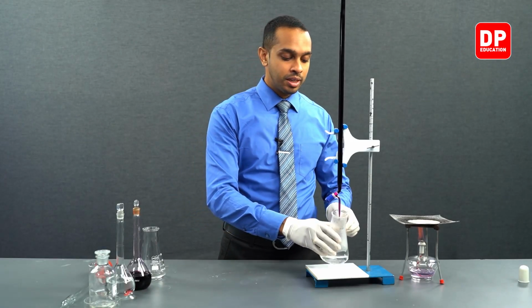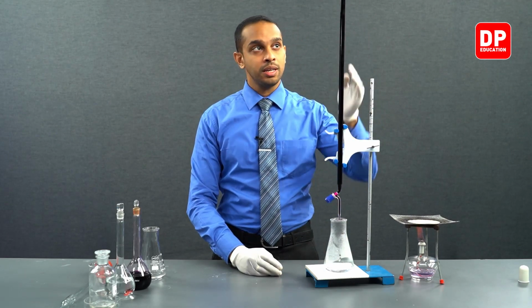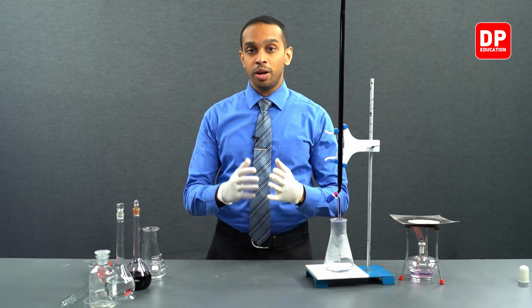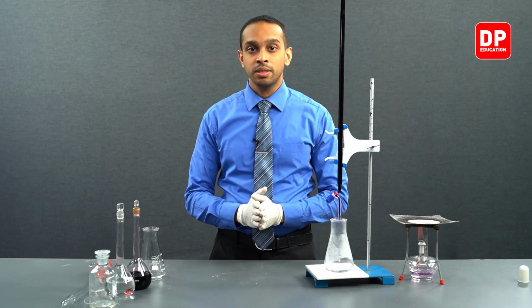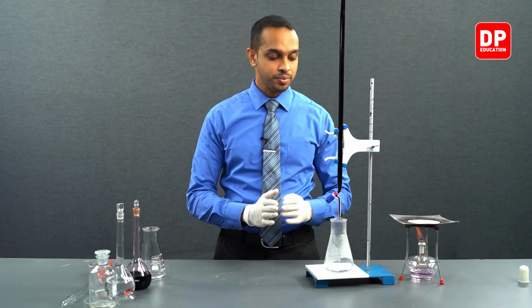And as you can see here, we have filled our burette again up to the 0 point, so that when we are doing our titration, we will have enough and more potassium permanganate to carry out our titration.